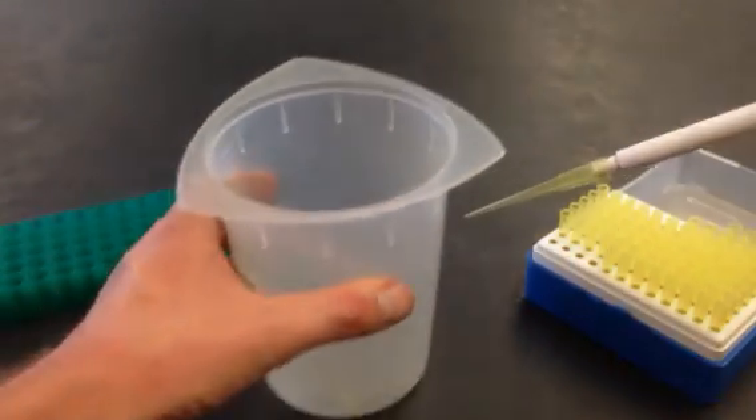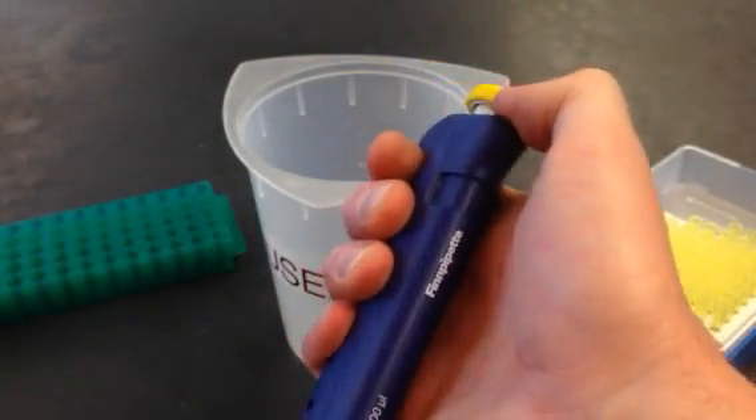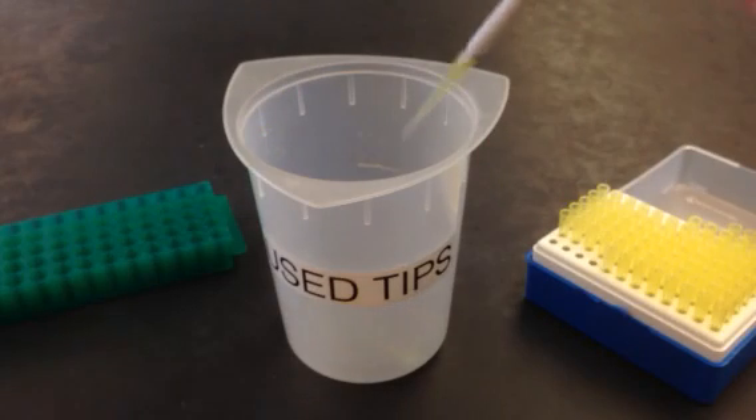I still have my tip on the pipetter, but there's another button on the side — this is the tip eject button — so I can just pop that into the used tip bin and I'm done.